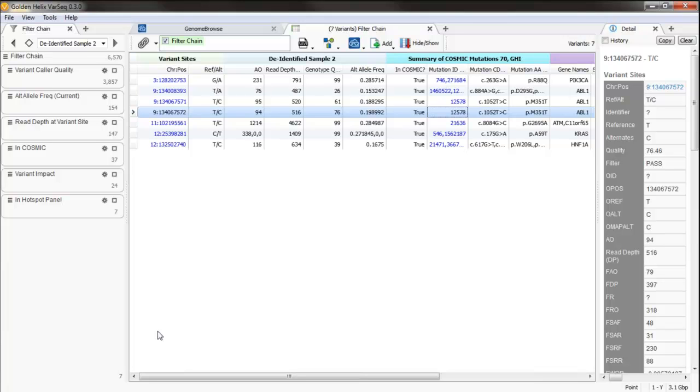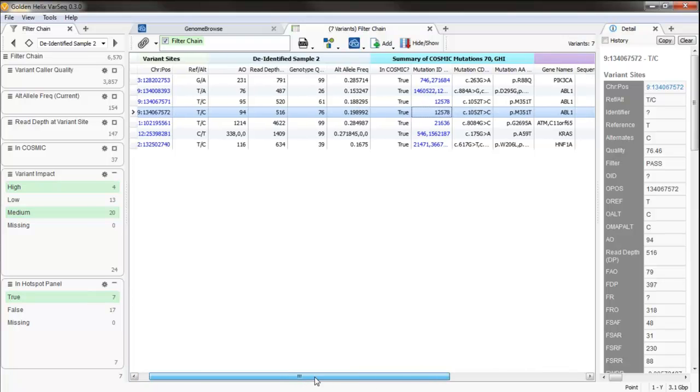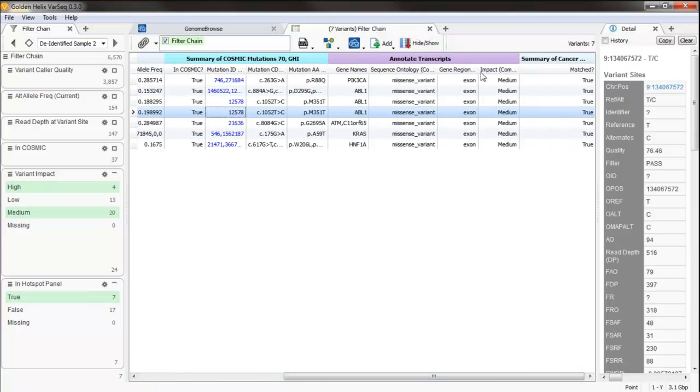Okay, so to start with, let's talk about drilling down. Drilling down can mean simply looking at more than just the final output of this filtering process. So even though I'm starting with these seven variants for this sample two, maybe I want to expand these cards, we call these cards here, and see what's going on at this level. So you can see actually that I am looking at just missense variants here. These are medium impact. Maybe I want to include low impact variants. I just click on that bucket, it highlights it, and now you can see that my seven variants has updated to eight. All of these numbers, in fact, are clickable.